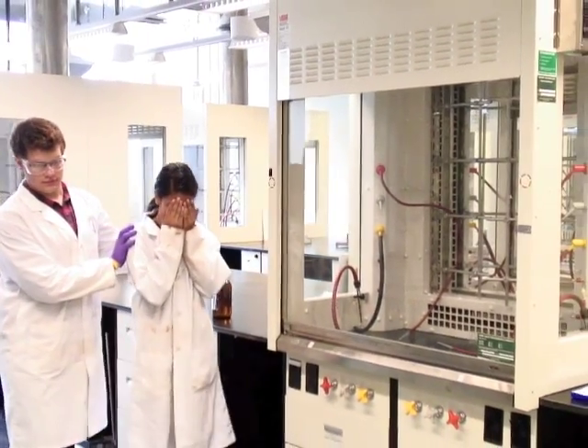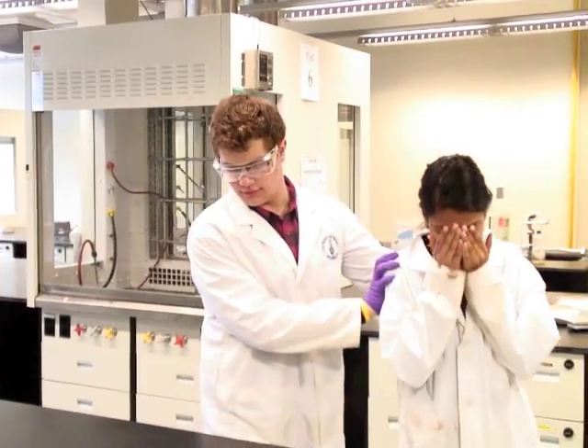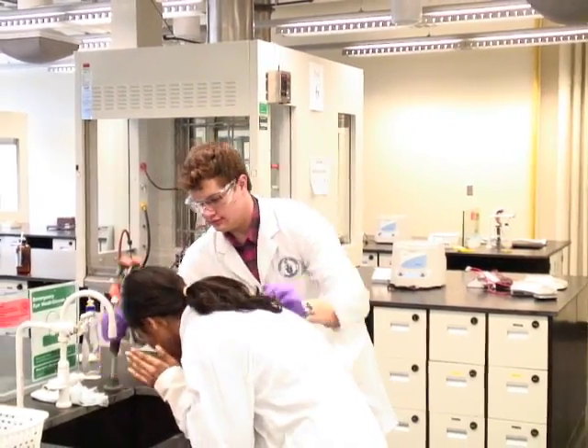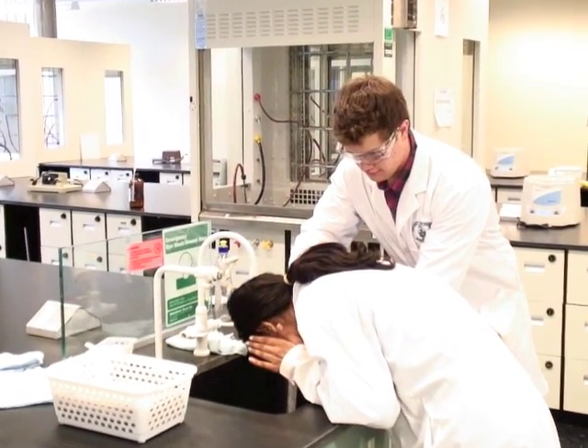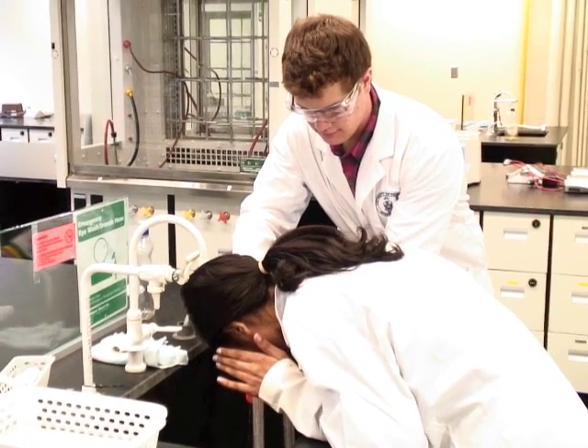Call for help in a loud clear voice. If you are nearby, please assist — help them find the eye wash. Hold the person by the shoulders and walk them to the nearest eye wash. Grab the eye wash nozzle and activate it. Hold the victim's head in place. Call for staff help, and the eye wash needs to continue for 15 minutes.